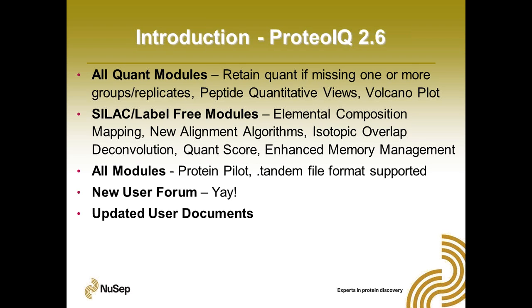Again, with all the other modules, we've added support for 2 new database search formats. We're now supporting the Protein Pilot search format. There are some specifics in the user documentation on how we support that, because it does require a conversion out of your Protein Pilot group file to an open source XML file. It's a 2-step process, pretty easy to do. Basically, the converter comes installed with your Protein Pilot software. So if you have Protein Pilot, you want to use it, you can bring it into ProteoIQ now.